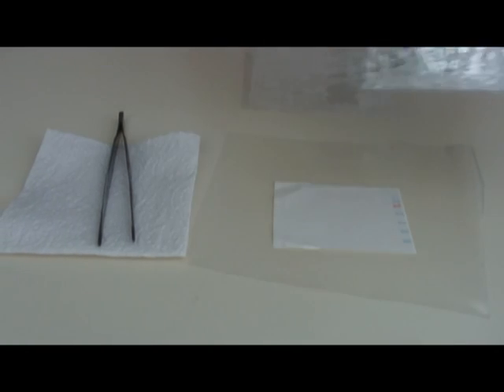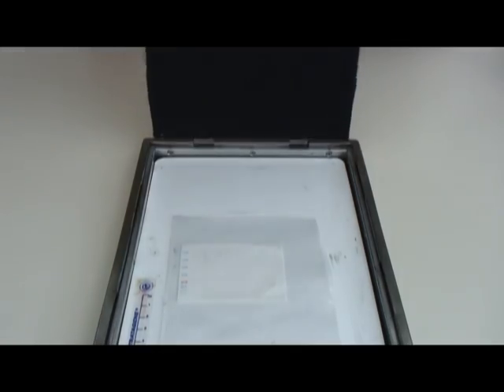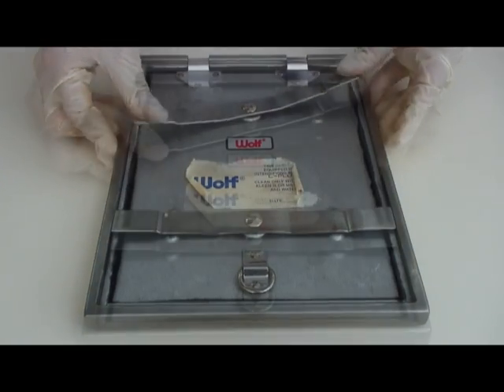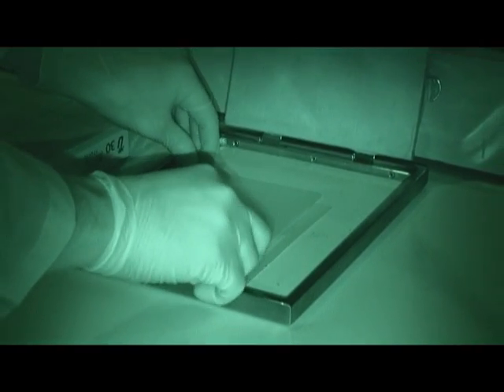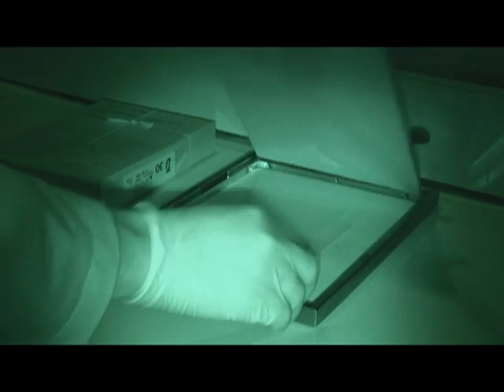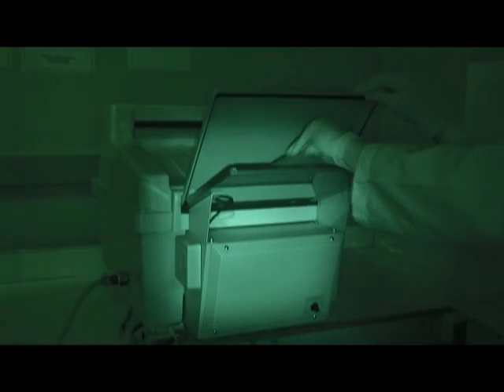Drain the excess solution from the membrane onto a paper towel. Place the membrane between 2 plastic sheets. Place the plastic sheets with the membrane in the cassette. In a dark room, take 1 X-ray film and put it into the cassette. Expose the membrane to the film for 1 minute. Place the film in the automatic machine. Wait for it to come out after being developed.